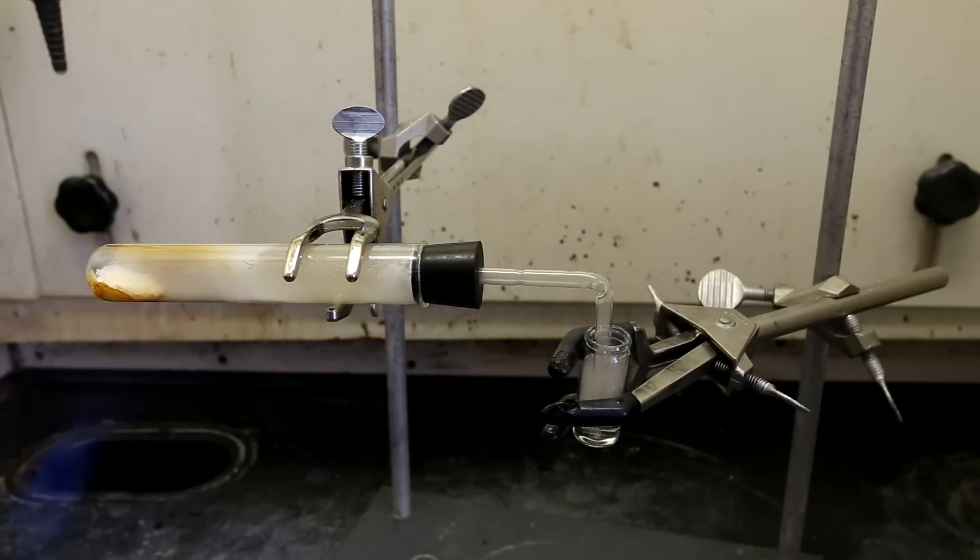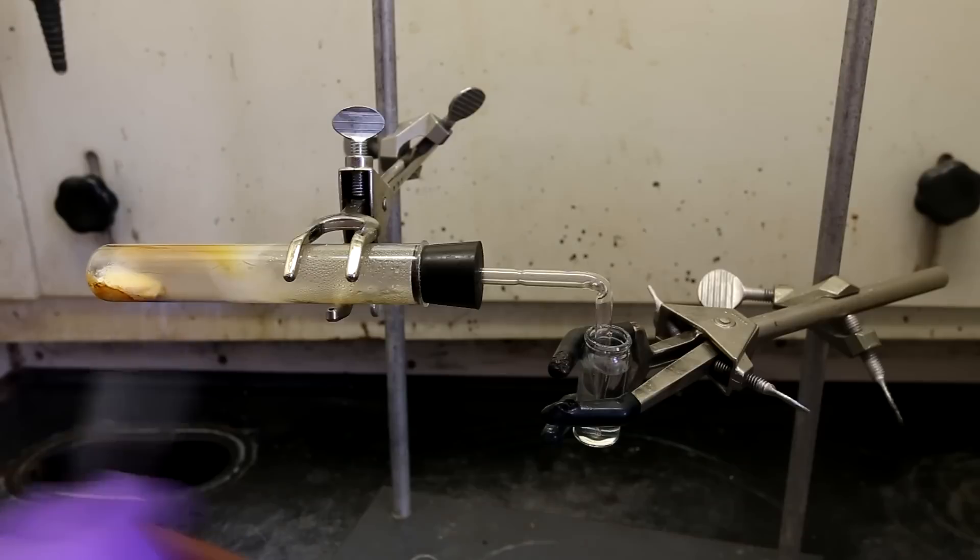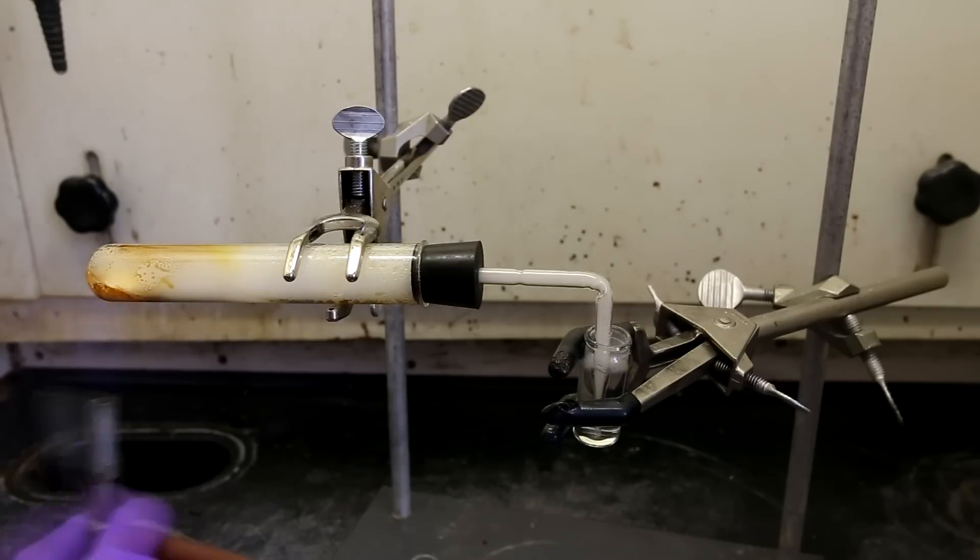It is important to use water here in the trap instead of ethanol because we are working with a flame. The water seemed a little bit low, so a bit more was added to the dram vial.